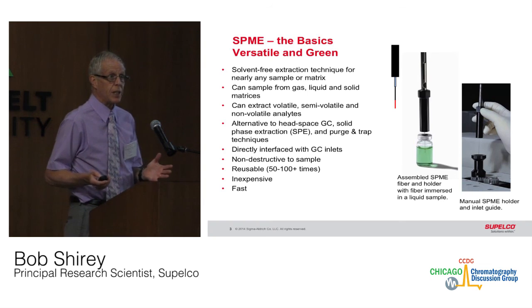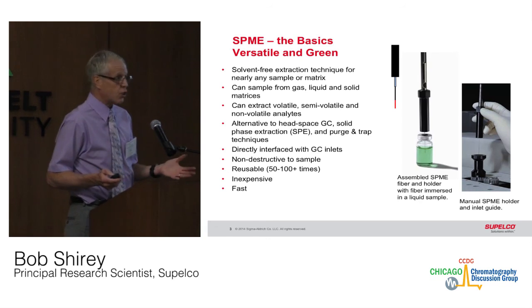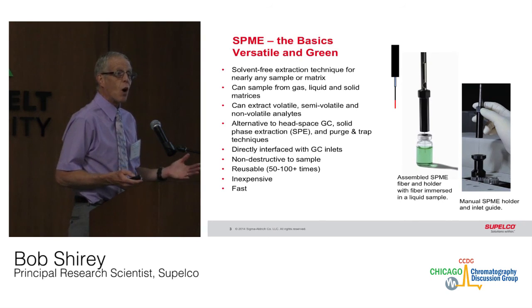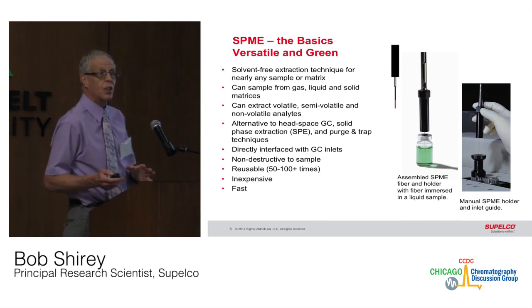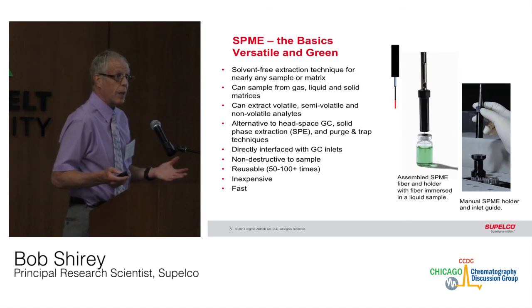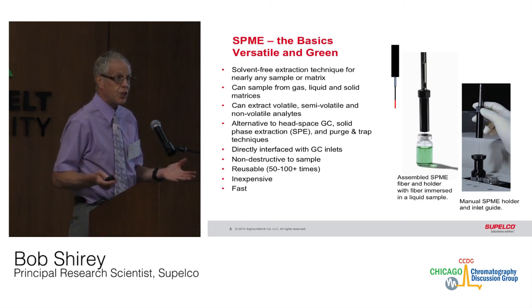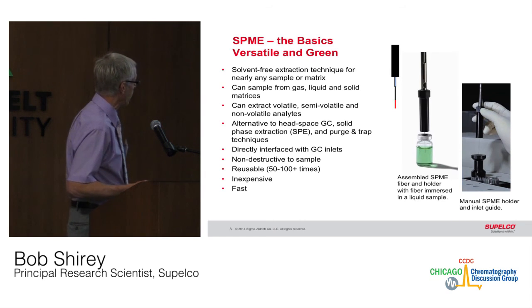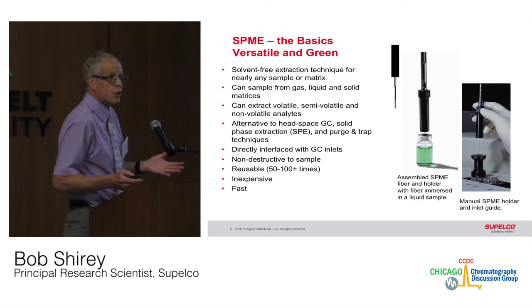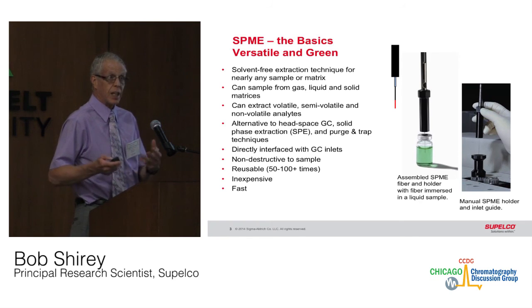Basically, SPME is a solvent-free extraction technique. You can extract from a variety of matrices. It can extract from volatile to non-volatile analytes. It's an alternative to many other extraction techniques, or in many cases complementary with them. It can be directly interfaced with GC inlets without having to modify your GC. It's non-destructive to the sample. It's reusable, which makes it fairly cost effective, and it's fast and easily automated.